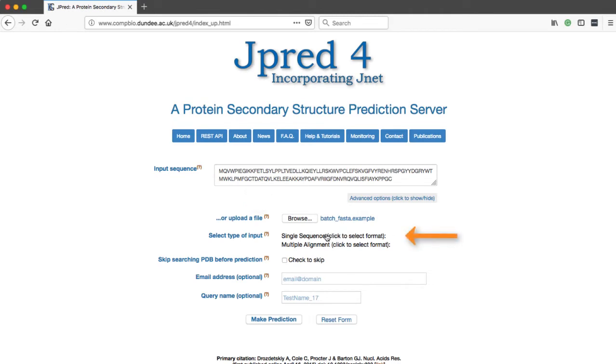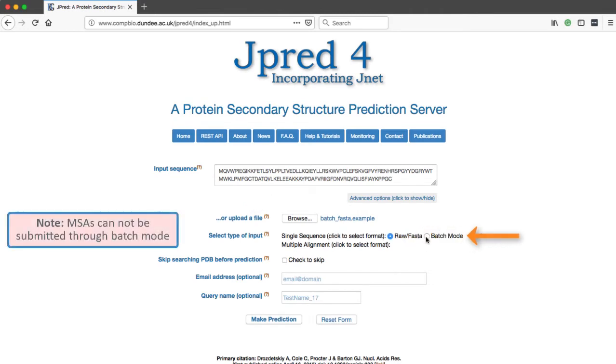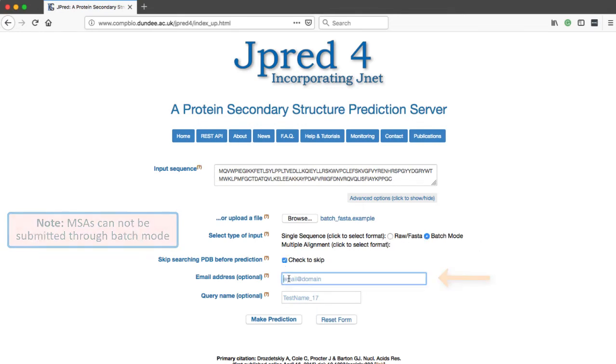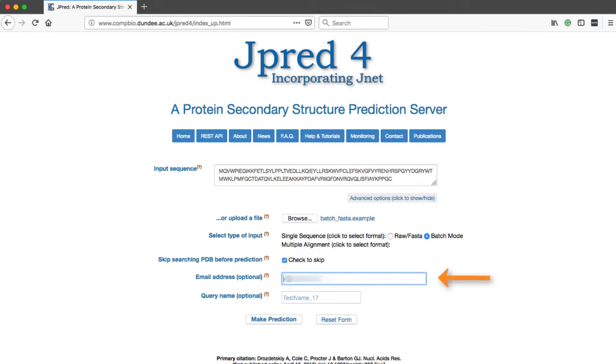In the Select Type of Input section, select Single Sequence, then select Batch Mode. In batch mode, you must add an email address.